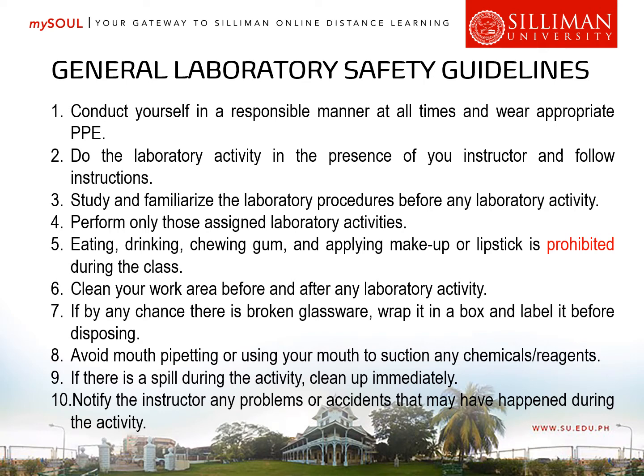Number four, perform only those assigned laboratory activities. So you are not allowed to perform anything beyond what is assigned of you to do or the activity for that day. You're not allowed to perform anything unless specified by your head medical technologist.